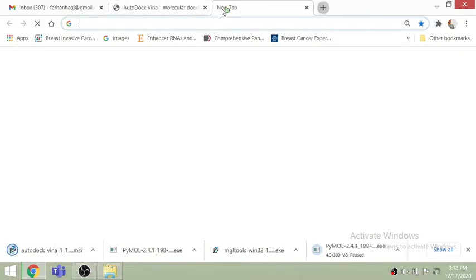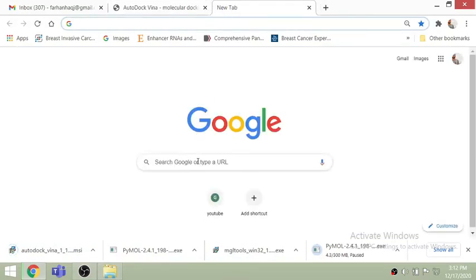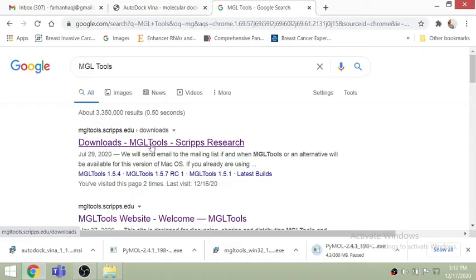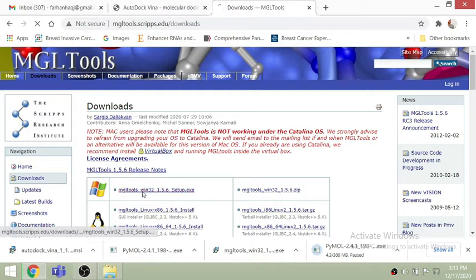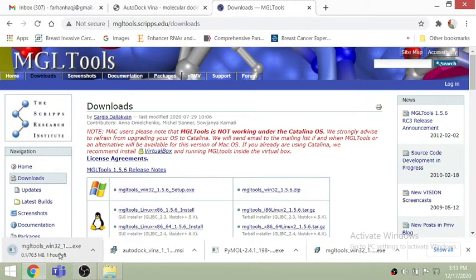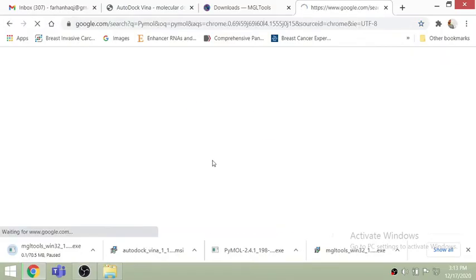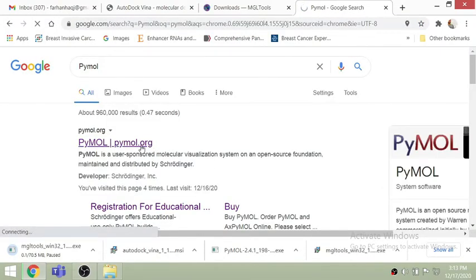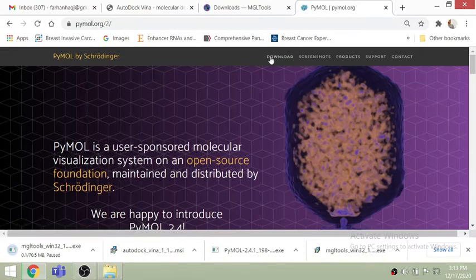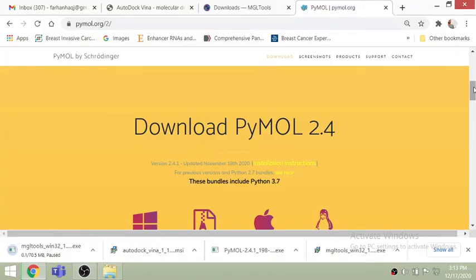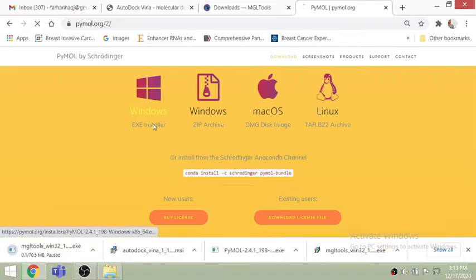First of all, go on the AutoDock website and download the AutoDock version for Windows. There are three tools you need: one is AutoDock, then AutoDock Vina, then you have to go to MGL Tools and download MGL Tools for Windows — download it depending on whether your Windows is 64 or 32 bit. The third thing you need is PyMol. These three things — AutoDock Vina, MGL Tools, and PyMol — are what you need for all your analysis, as AutoDock is an open-source program for molecular docking.